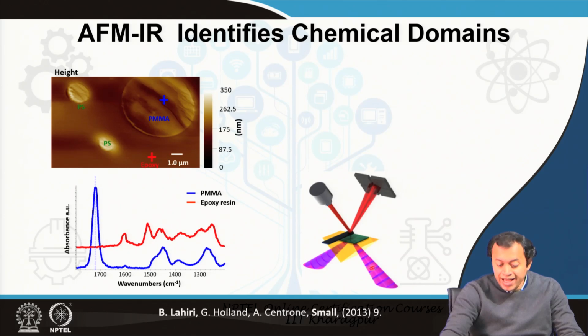So, now I have fixed the wavelength of my pulse laser to this only. The wavelength of the pulse laser is something that is absorbed by PMMA and not by polystyrene. I do not know in this sample where PMMA and polystyrene are, they are randomly distributed. If I do an FTIR spectroscopy, I know that these materials are present, but the location of them I do not know.